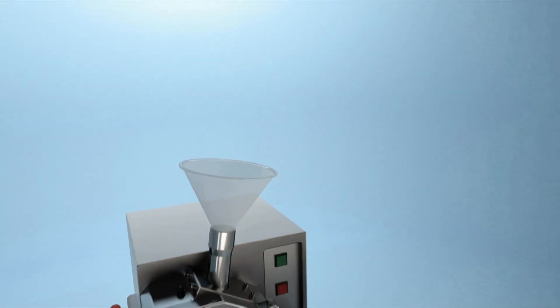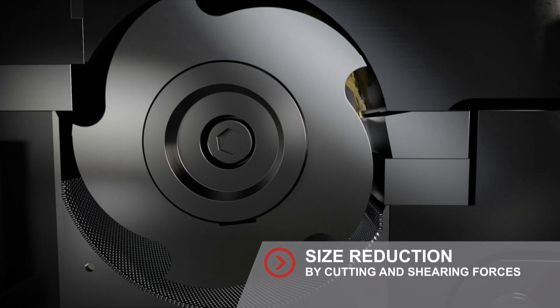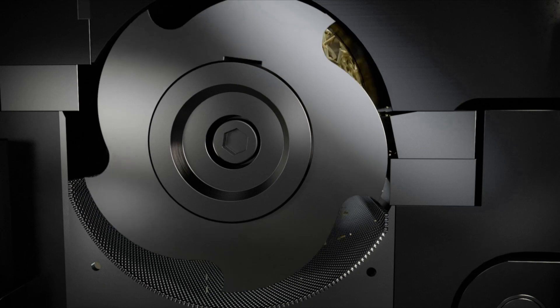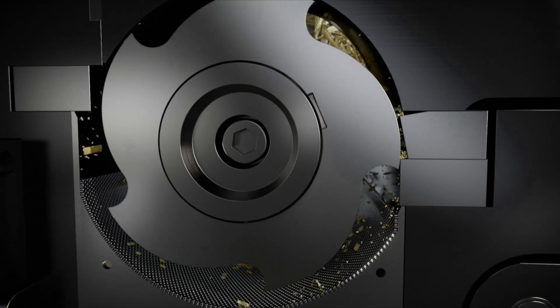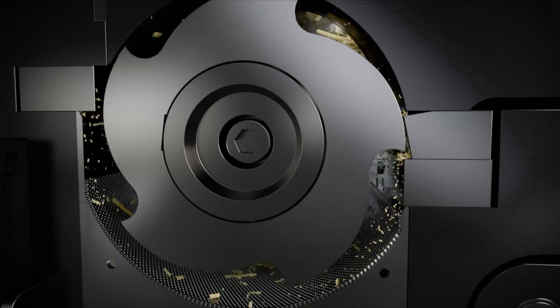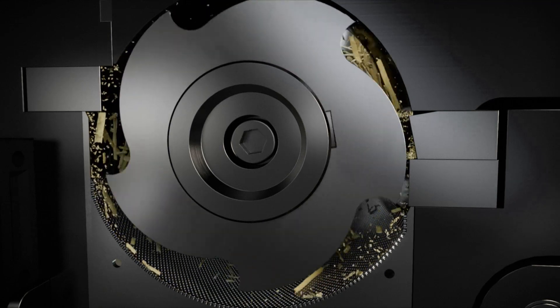Cutting mills comminute sample material with a rotor fitted with knives in combination with fixed stator knives by cutting and shearing forces. Due to the progressive cutting geometry between the cutting edges of the rotor and the fixed knives, the sample material is automatically transported until the desired final fineness is achieved.